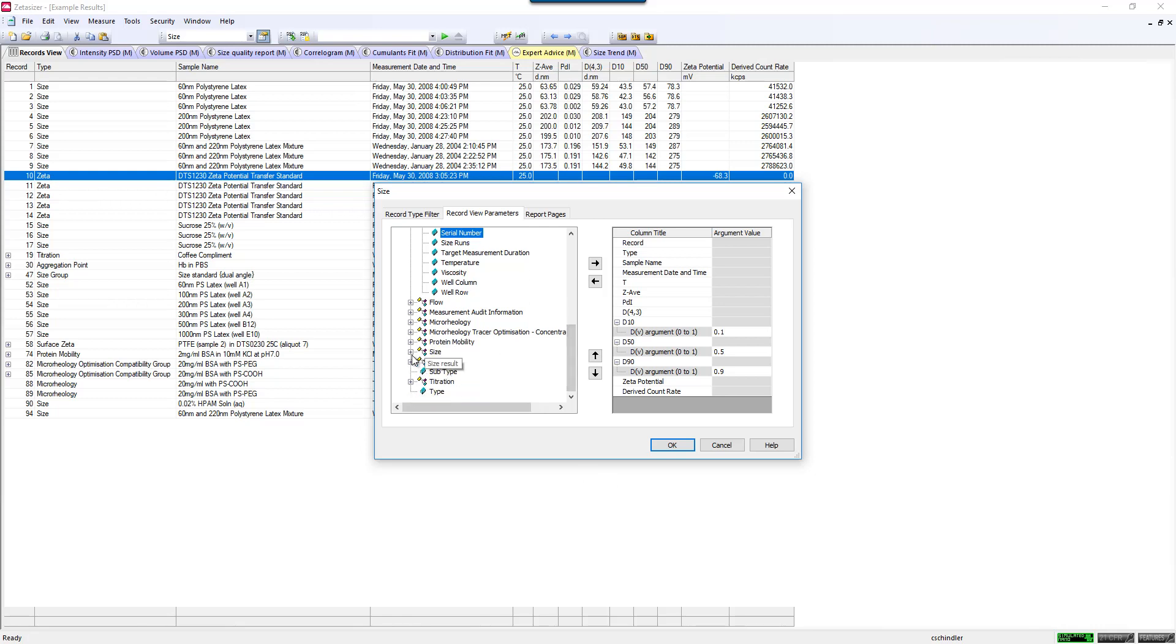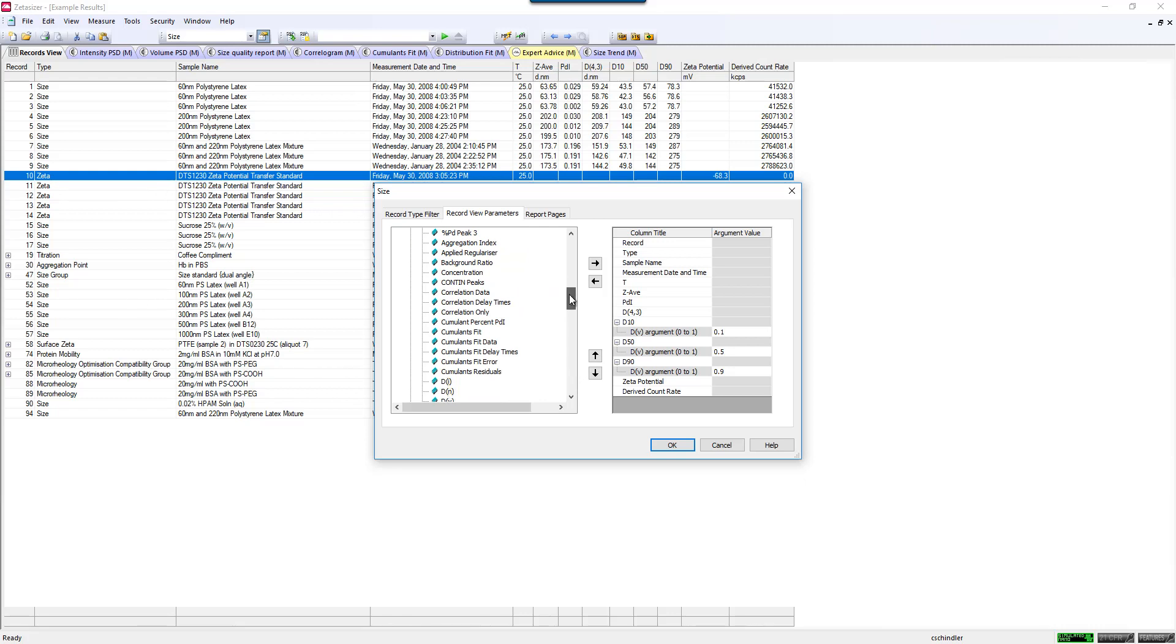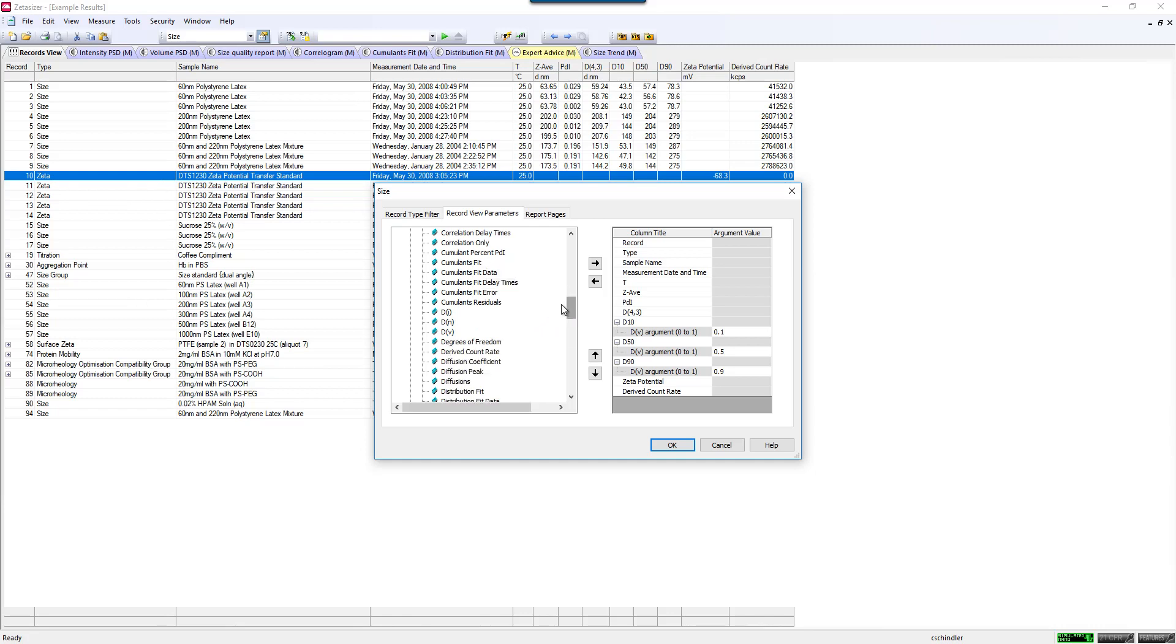Another one for sizing, we can go down to the size tab here, and there's all different types of things that I can put here. I could look at how good my fit is of my cumulants or distribution fit. If you're familiar with D values, like a D50, D90 value, that's a volume-based distribution. You can display all of those as well. You can see some of those that I've put over here.